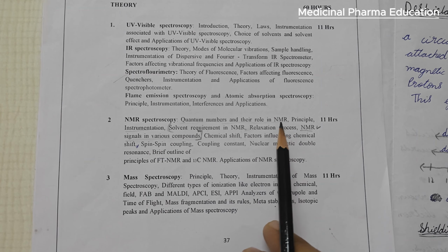The difference between these two protons, of the sample and the reference, is called chemical shift. Chemical shift is measured in delta values. The value ranges from 0 to 10 for most of the compounds.